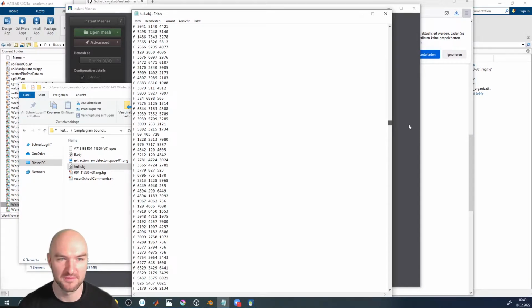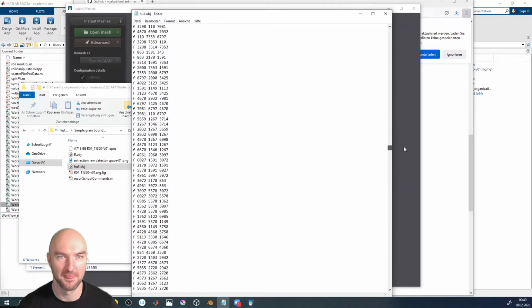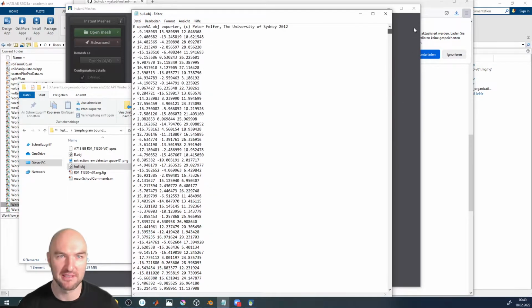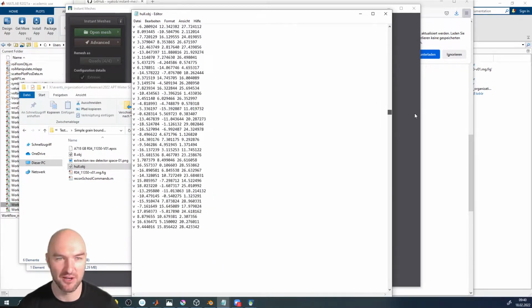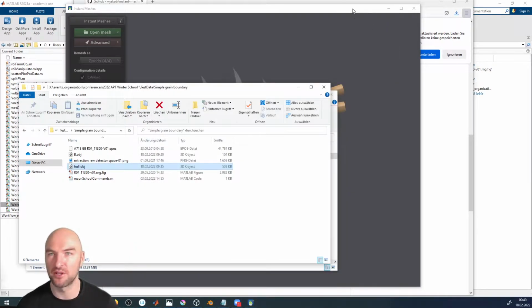Object mesh 1, that looks fine. So maybe something that's unfinished. I have actually no idea. It's a very nice looking OBJ file, so I have no idea why I can't load it. Weird. Anyway, we're not gonna remesh it for now.